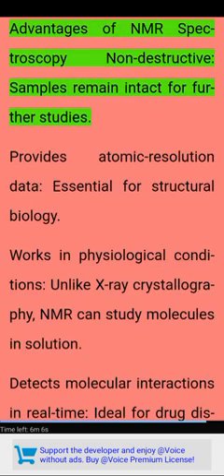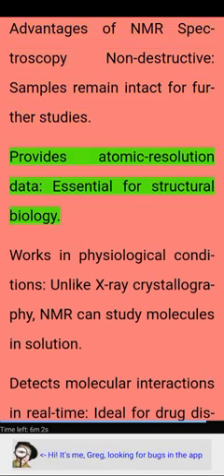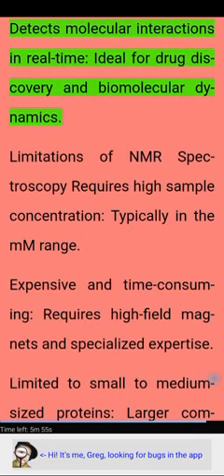Advantages of NMR spectroscopy: non-destructive, samples remain intact for further studies. Provides atomic resolution data, essential for structural biology. Works in physiological conditions. Unlike X-ray crystallography, NMR can study molecules in solution. Detects molecular interactions in real time, ideal for drug discovery and biomolecular dynamics.